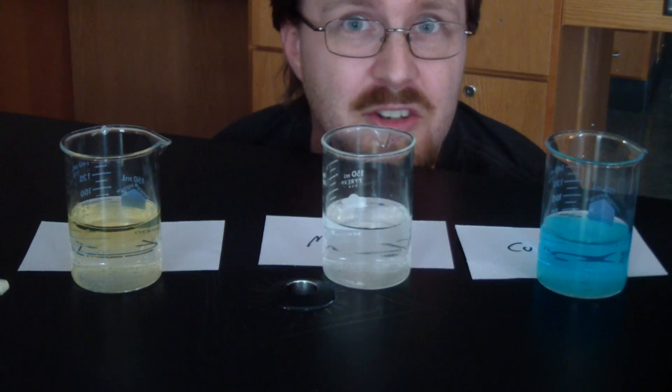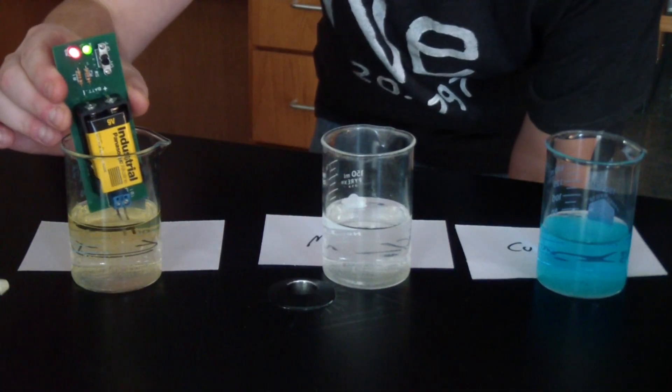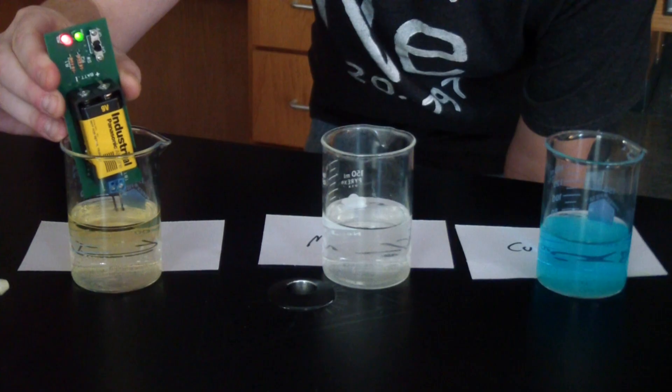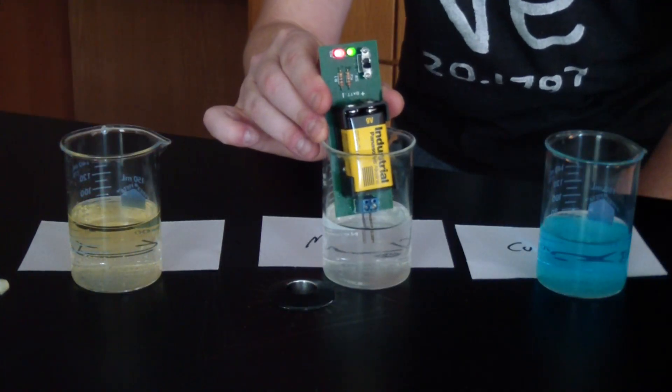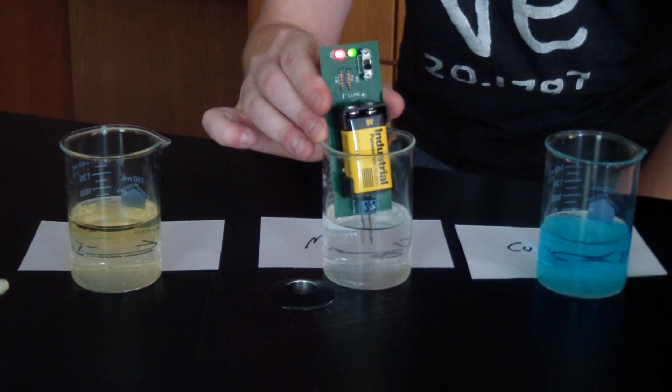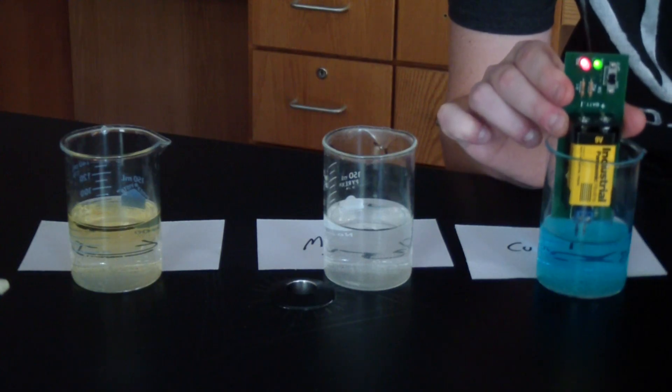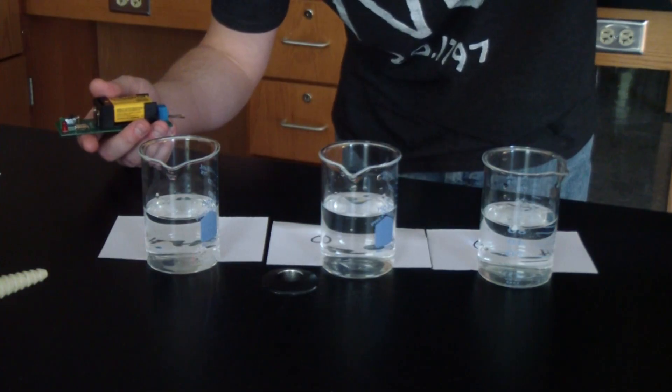So this is an ionic compound called potassium iodide, and you can clearly see the lights are coming on. So this does conduct electricity. This is magnesium chloride, also an ionic compound, and it conducts electricity. Here is another ionic compound called copper nitrate, also clearly conducts electricity. But what about the covalent compounds?